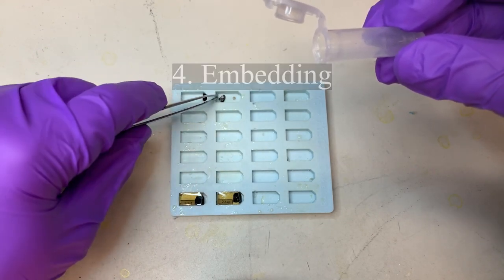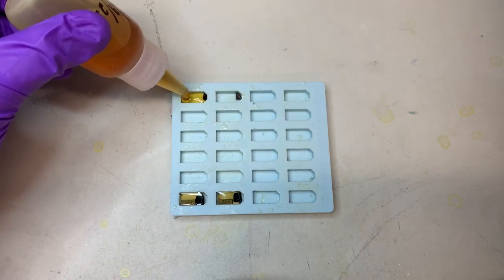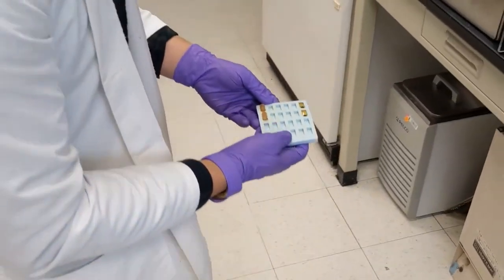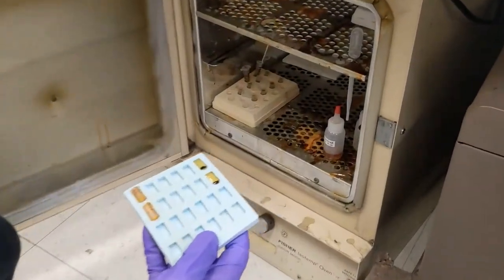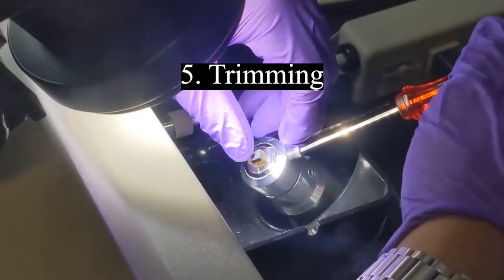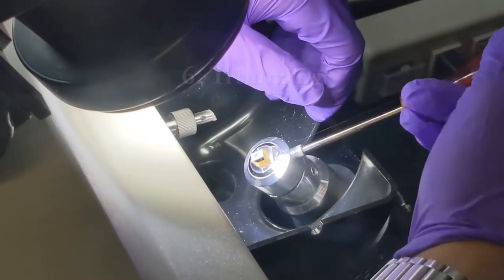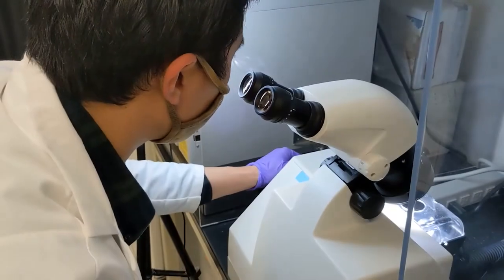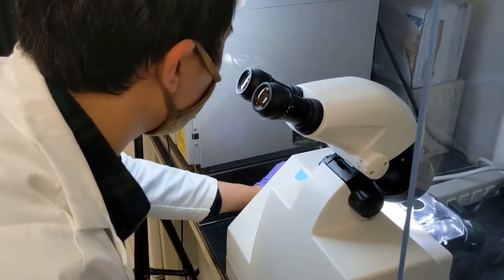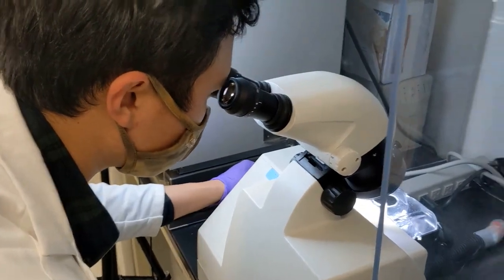The sample is then left to cure in a silicone mold with epoxy resin overnight at 60 degrees Celsius. This epoxy will provide the sample with sufficient structural integrity to withstand the pressures of trimming and sectioning. A high-speed milling system trims excess resin by passing a rapidly rotating milling cutter across the surface of the sample. This step will also serve to minimize the friction between the block and the knife edge when sectioning.